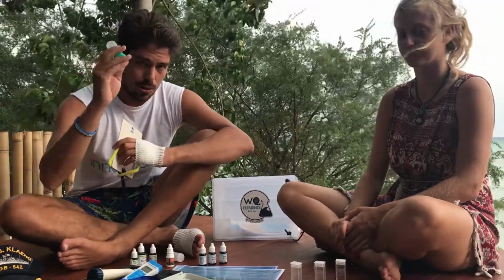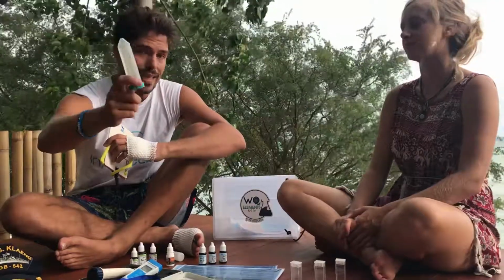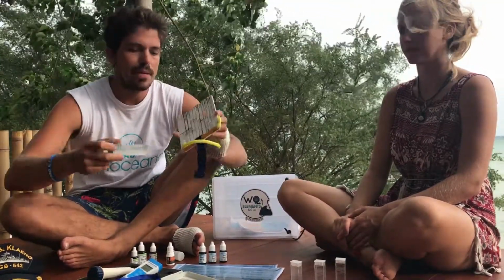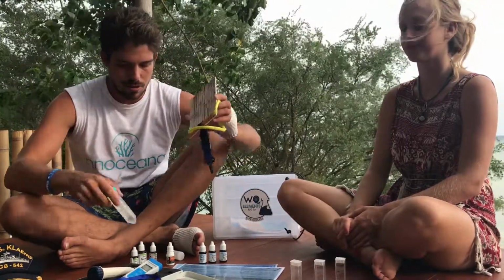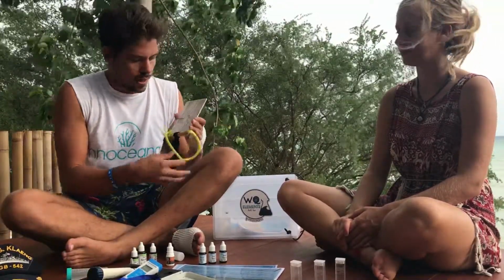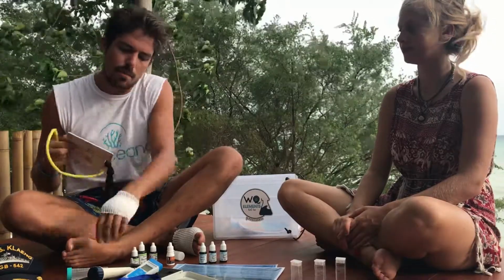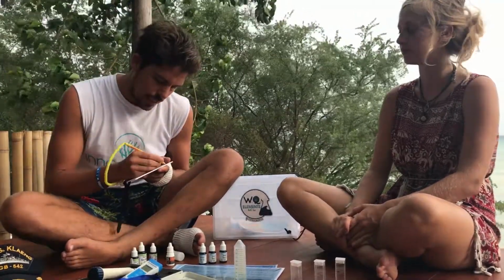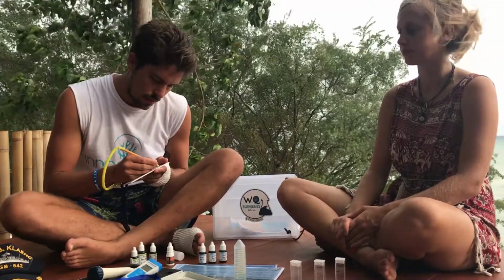After that, you are going to go to the boat or wherever you go with this sample, and you are going to continue taking all of the rest of the parameters that Laura is going to explain to you in a minute. So, very quick. In this case, because this sample is coming from Chalok and from the shore, what I'm going to put here in the site is Chalok Bay.